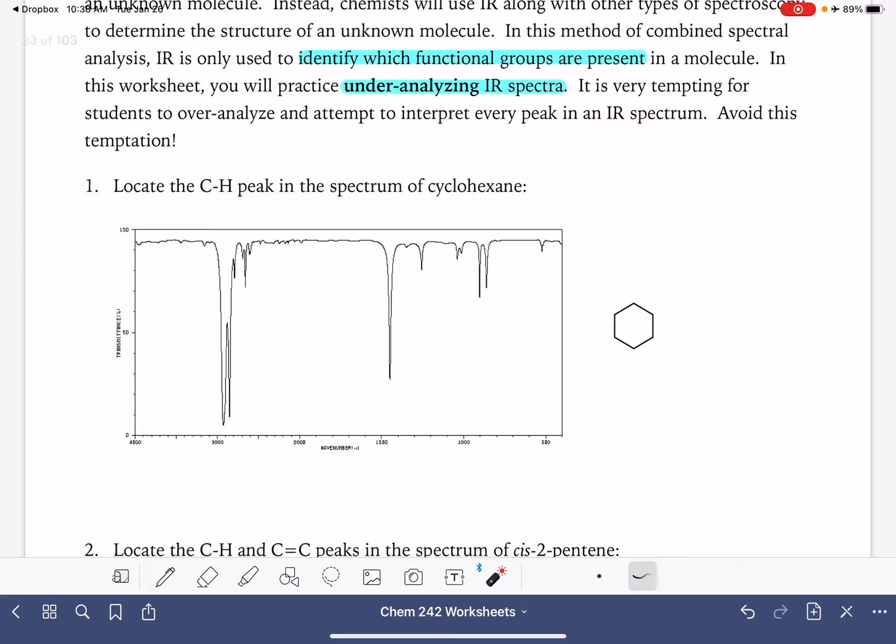So this is the IR spectrum of cyclohexane. Here's the cyclohexane molecule, and all that we're going to do for the cyclohexane molecule, because it does not have any functional groups present, we don't expect to see a lot of stuff in the IR spectrum and we don't. It's pretty basic. And we just want to locate the presence of the carbon hydrogen peaks. Carbon hydrogen peaks are ones that you should always get used to seeing because they're pretty much always present in all of our molecules located around 3000 wave numbers.